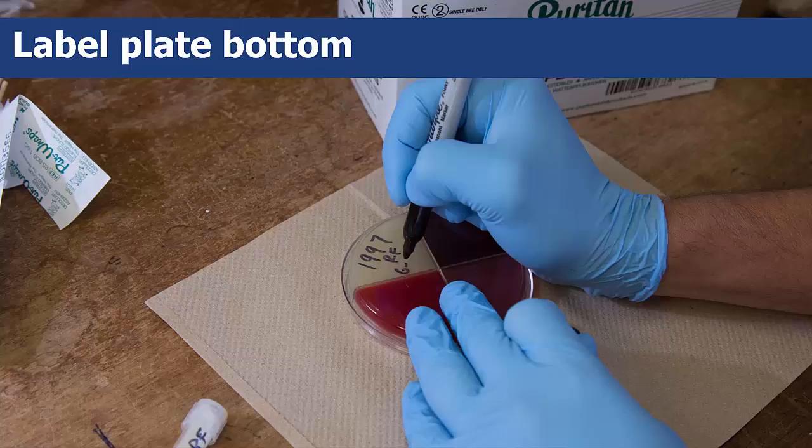Be sure to wear gloves while handling all the culture supplies. You should take every precaution to eliminate contamination for the best results.